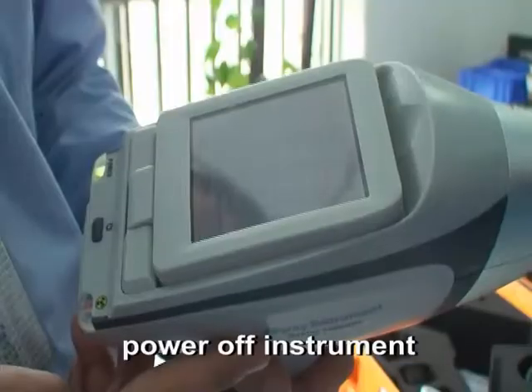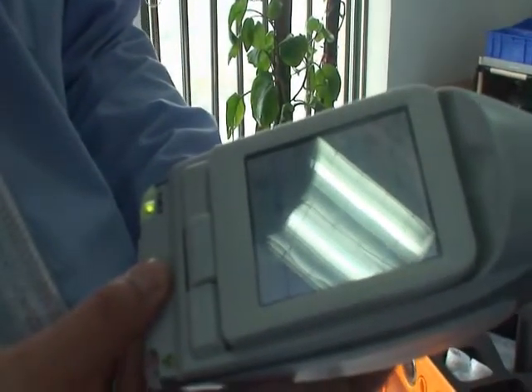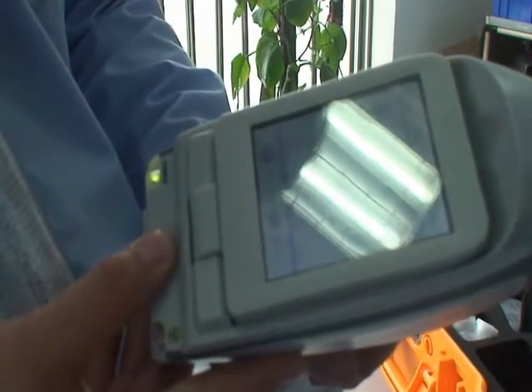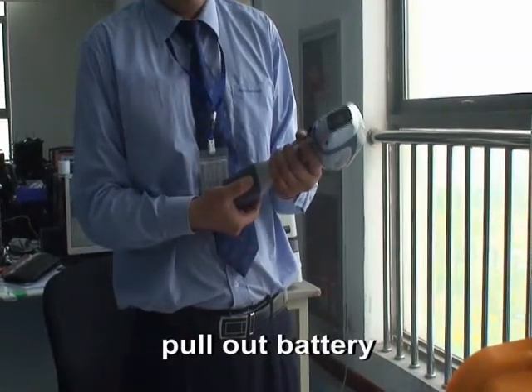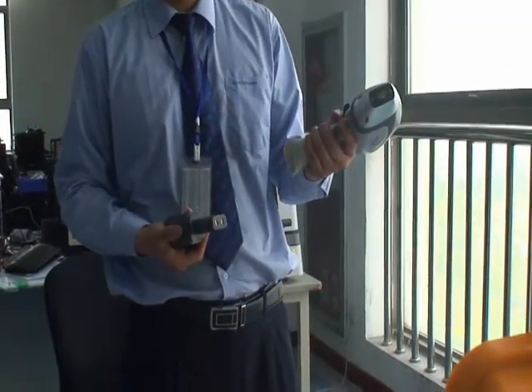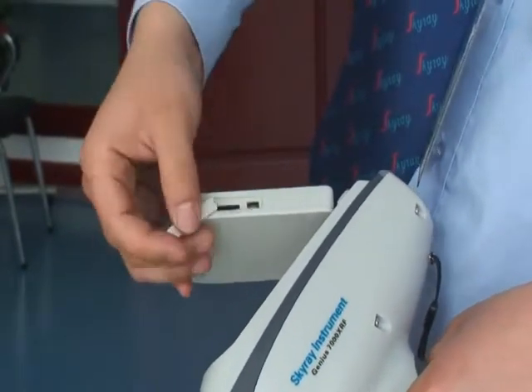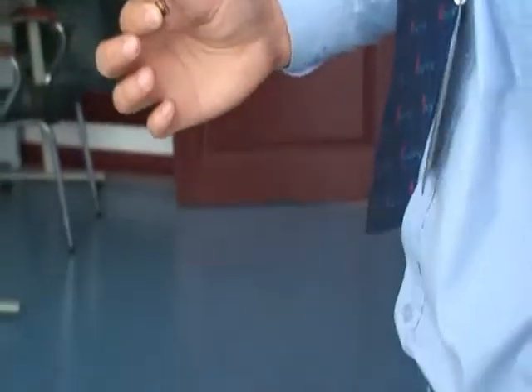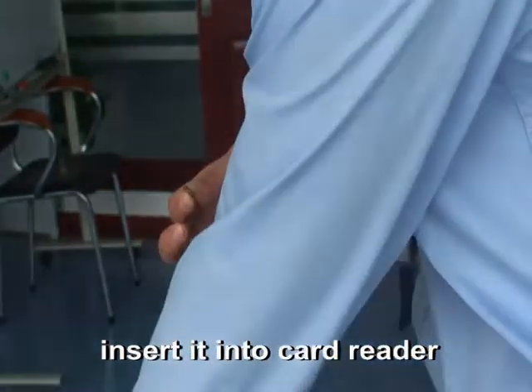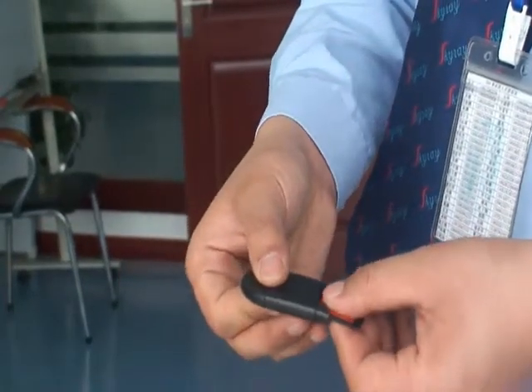Press the power button for 5 seconds to power off the instrument. Press the fastener to take out the battery. Take out the SD card, insert it into the card reader, then plug the card reader into the computer.